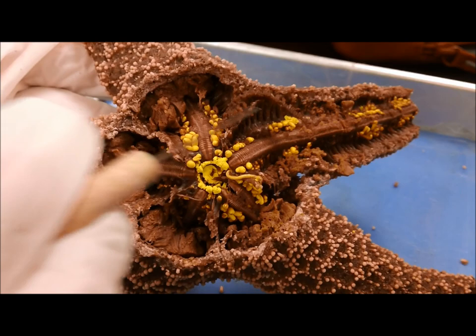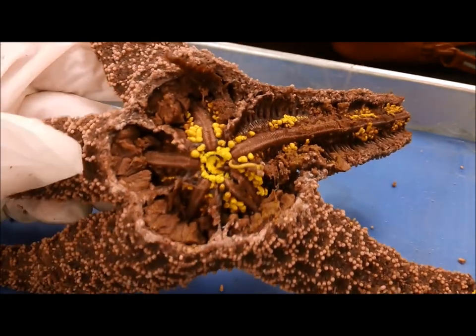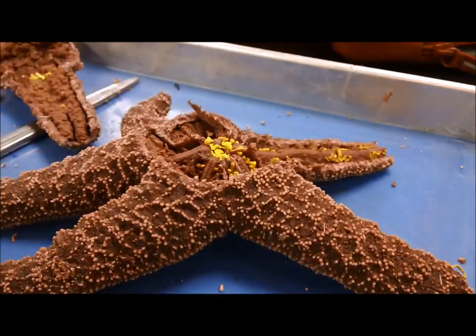And again, you can see the gonad really well here. Okay, thank you.